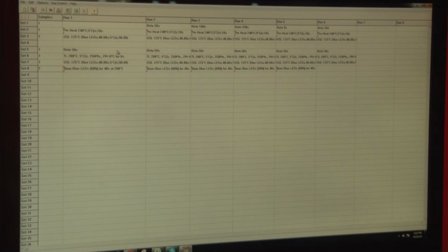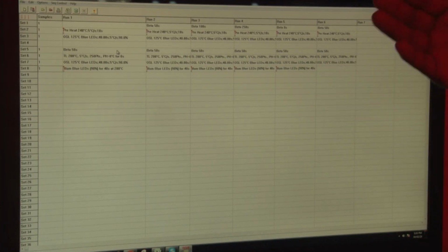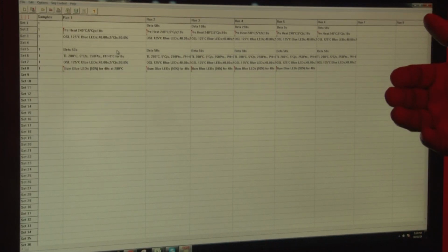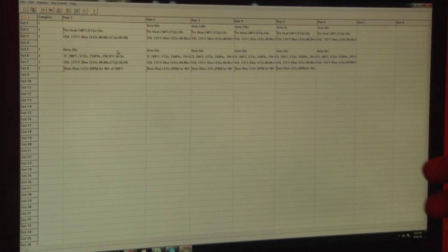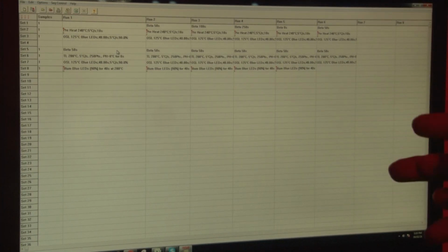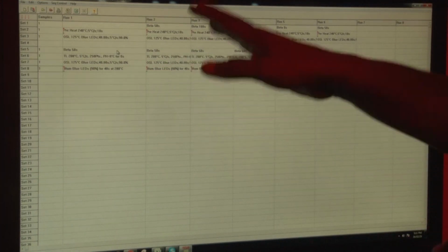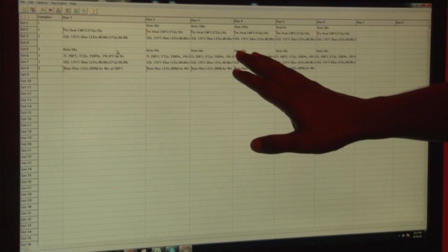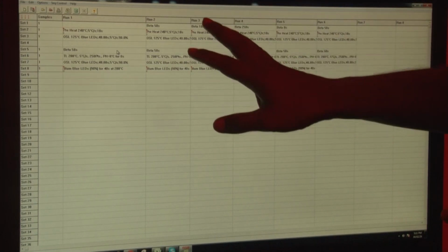Due to this change in orientation, the crystal behaves differently. Sometimes it gives less luminescence, or sometimes more. So to check the sensitivity, we assign a constant test dose in each run.